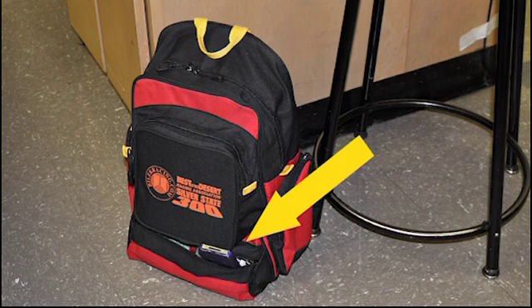Rule number 8 also requests you to turn off your cell phone and keep it stored during the lab period. Do not make, receive, or answer any text messages during the lab period. Cell phones, iPads, and laptops are no longer allowed on the microbiology lab table and must not be accessed during the lab period. Consult your lab instructor if an emergency situation exists.